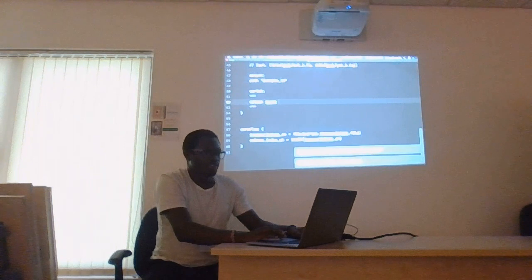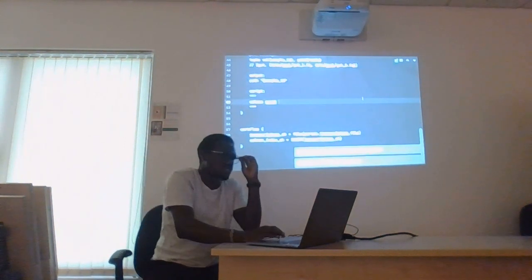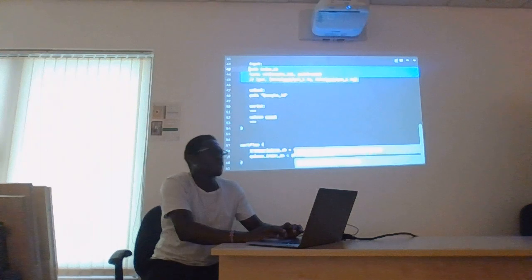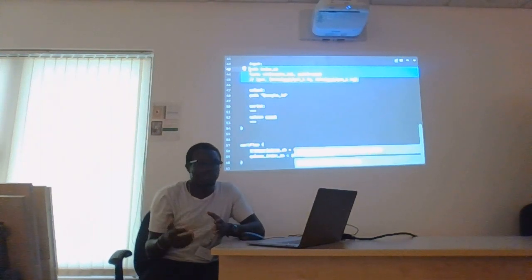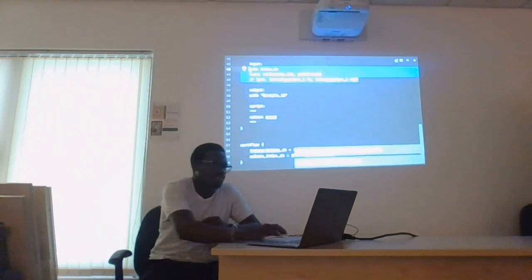I know it's lunchtime and I'm taking much of your time, but you can see the essence of this. What is important here is that you must know how you organize your channels. I think that is critical. Once you know how you want to capture the channel, your input and output, it makes work much easier.